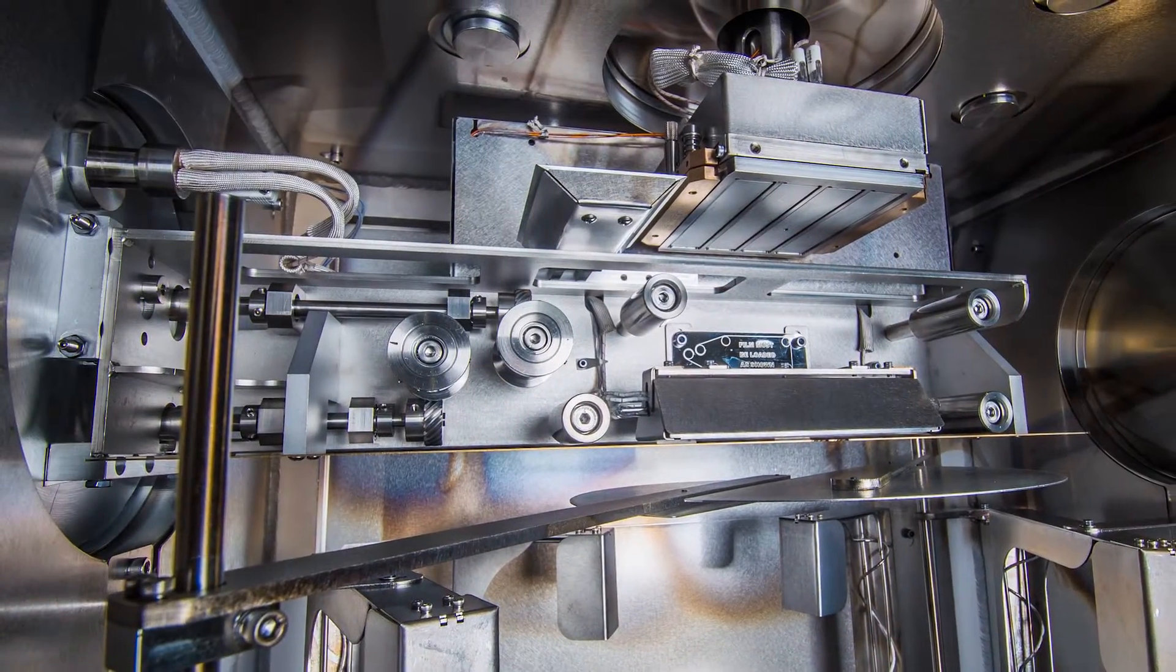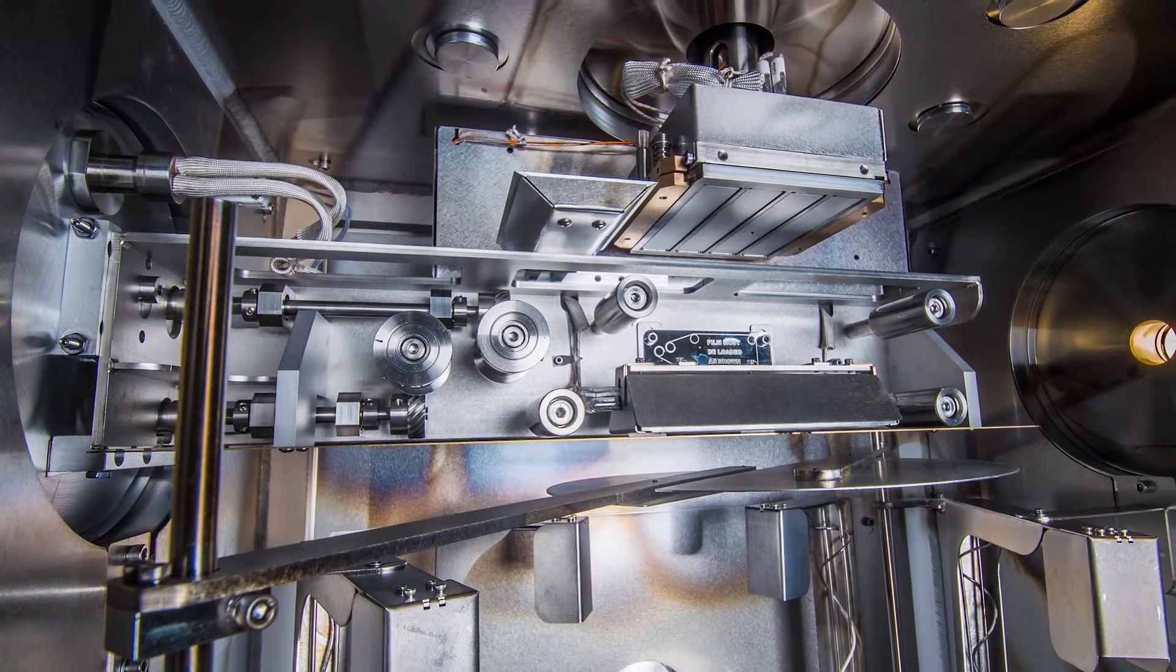And I see that Angstrom is paying attention to those kinds of things with some of the other kinds of add-ons, whether it's the in-situ mask transfer or the roll coater that you can put into the chamber or even some of the other kinds of deposition sources. Ours are mostly for the inorganics.